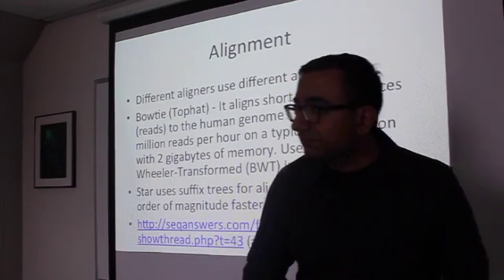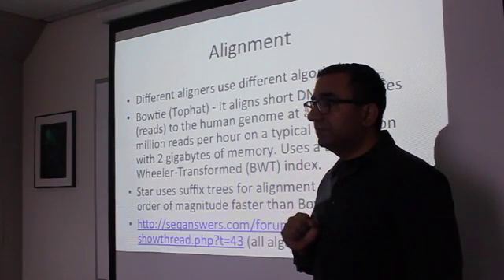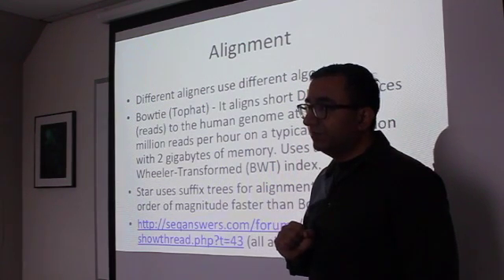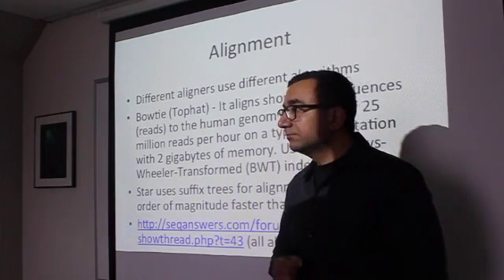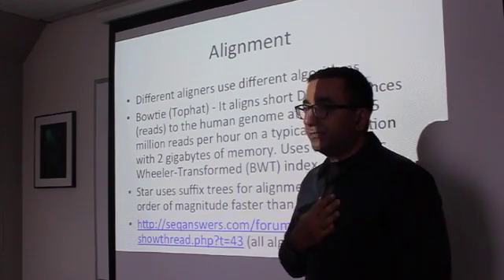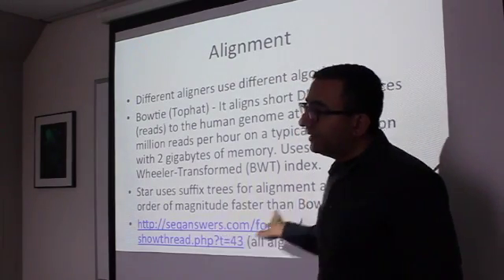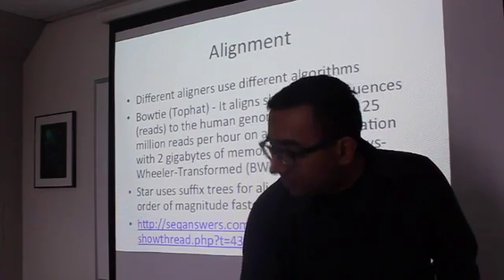You don't happen to know which one Ben Whitner uses, do you? Ben uses Tophat. Yeah, I think he may be switching to STAR. I guess there's also a difference from organism to organism. Yeah, whichever works better, exactly. For human and mouse, I've used STAR, and it seems to be doing okay.